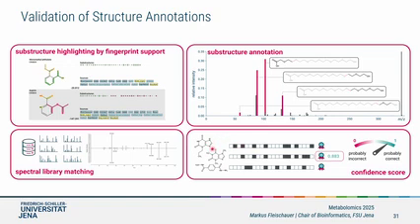So the basic confidence score is for an exact hit. It says how sure am I that the top structure is correct? But it sometimes happens that you have the top 3 structures and they are extremely similar. Just some functional group has shifted one position, and usually it's pretty hard, sometimes even not possible, to tell with mass spec whether it's this or this structure.